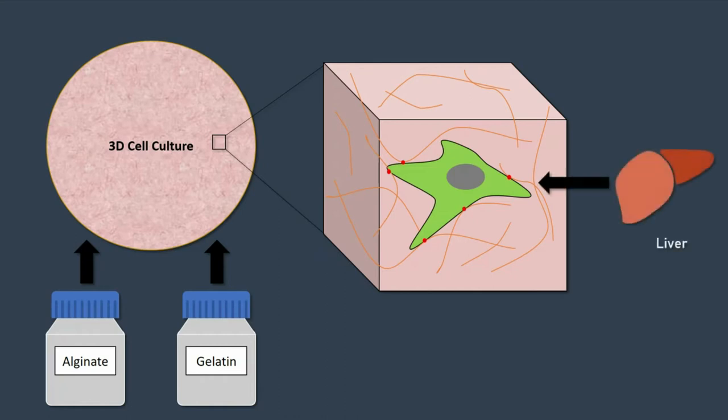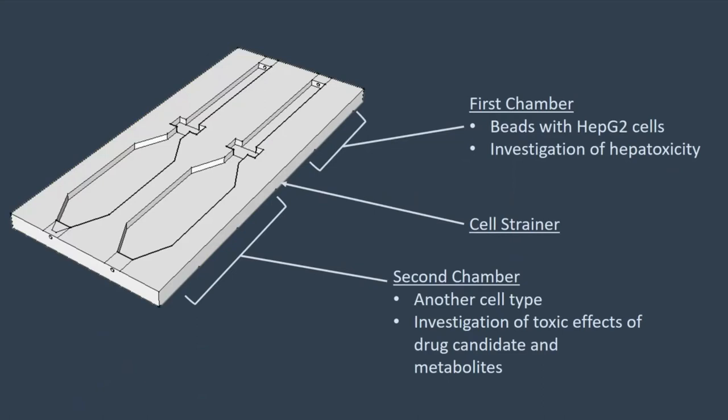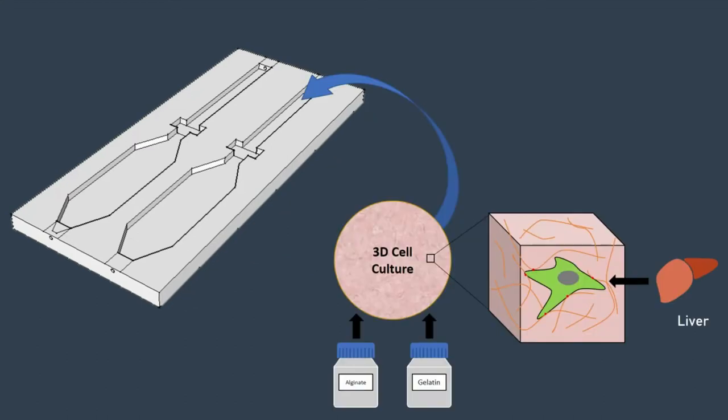For the 3D culture, we embedded HEPG2 liver carcinoma cells in alginate gelatin hydrogel beads. The liver-on-a-chip system consisted of two chambers that were connected in a continuous fluidic system. The beads were placed in the first chamber of the chip, the second chamber was intended to hold another cell type in order to investigate possible toxic effects of the drug candidate and its metabolites.